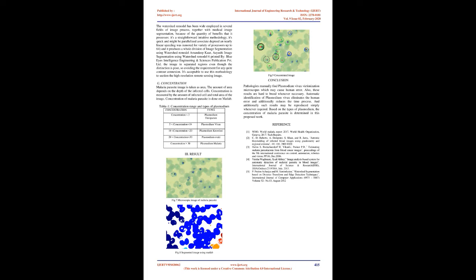There are several commands employed in morphological processing. Some commands are disk, spur, perimeter, skeleton. The pruning algorithm is a technique employed in digital image processing based on mathematical morphology. It's used as a complement to the skeleton and thinning algorithms to remove unwanted parasitic elements, spurs. The bwperim function determines the perimeter pixels of the objects in a binary image.